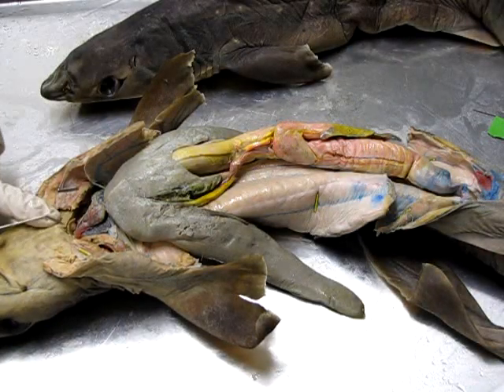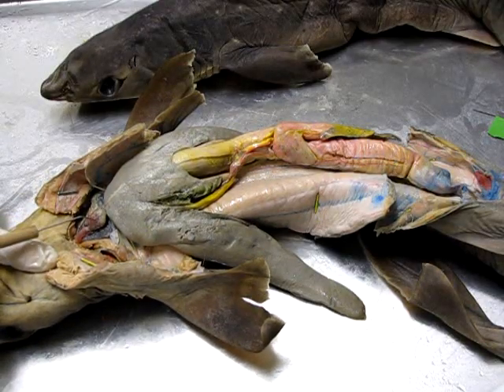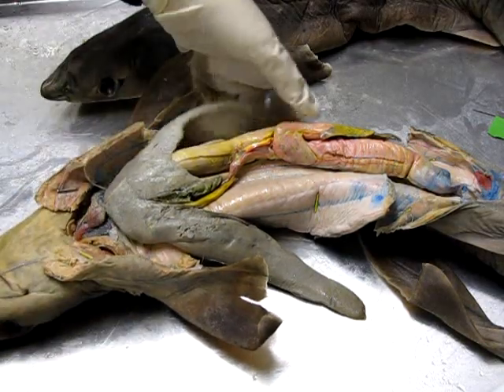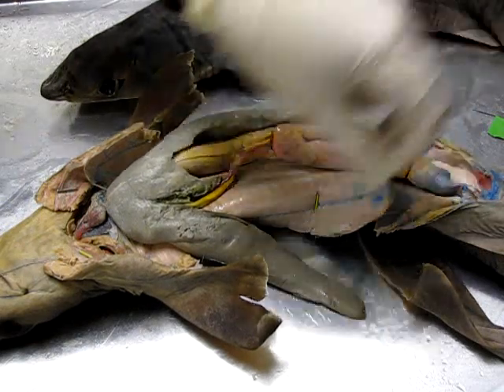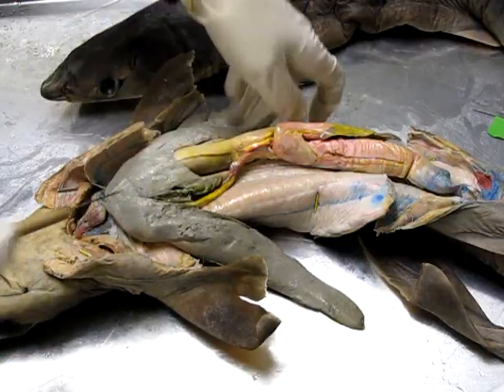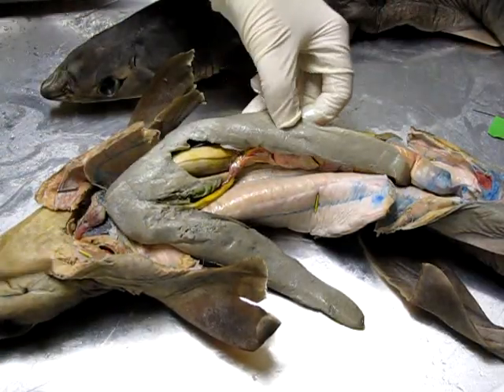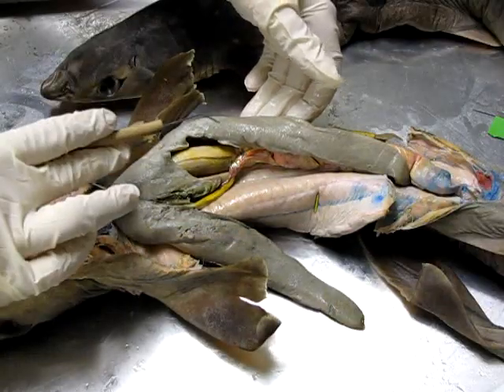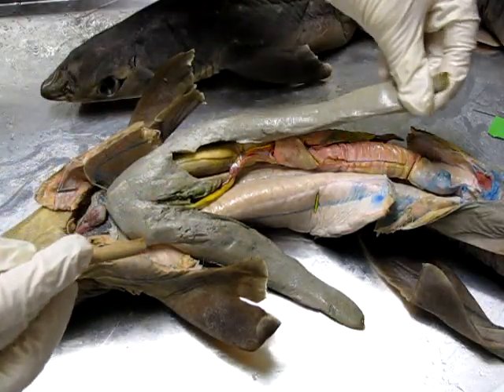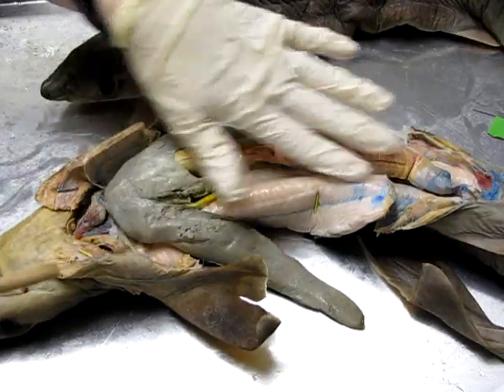We'll do a little tour of some of the internal anatomy, starting at the anterior end where we can see the heart right here. Below the heart we have this large three-lobed structure — as we've seen in other animals, the largest organ tends to be the liver, so this is all liver.